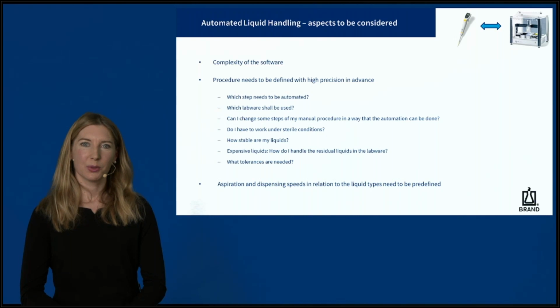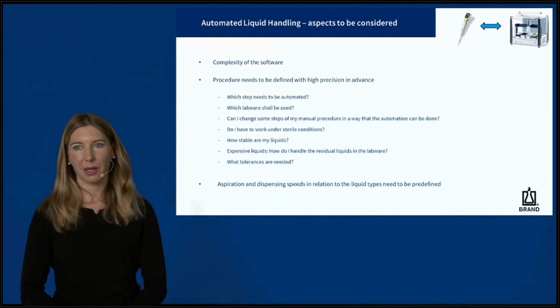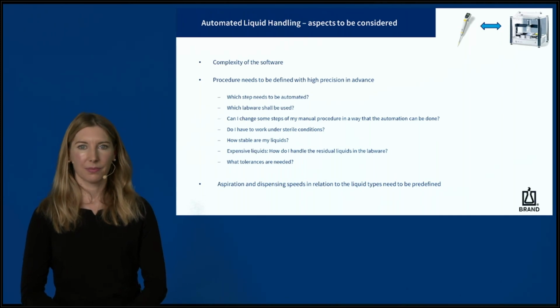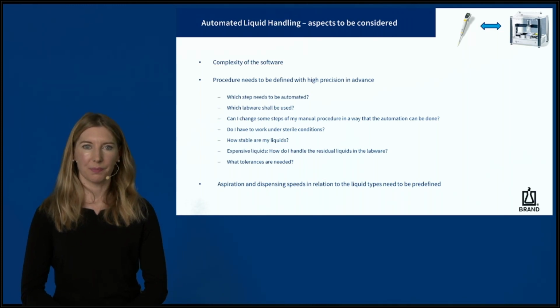Before you decide to automate your PCR, there are a lot of aspects which must be considered upfront. A first point is the complexity of the software. There are many automated liquid handling devices which address different requirements on the market. Therefore, it is important to define your needs before you start to choose an adequate system.